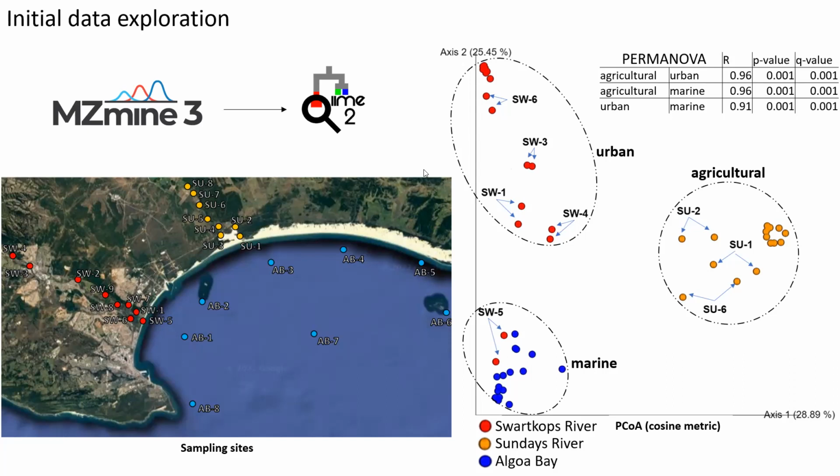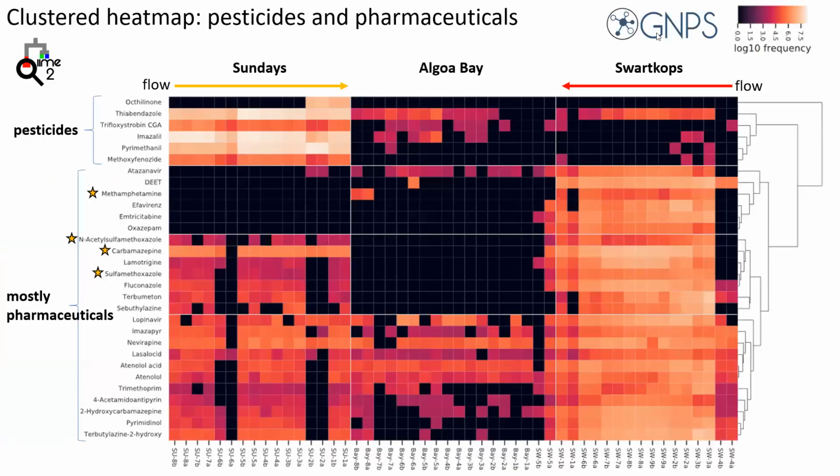What I did in the next step then, so upload the data to GNPS, and we have about 4,000 features altogether, and we got matches through GNPS for more than 200 of them. But now I had to manually curate them because sometimes you get matches that are basically false matches, so you can't trust it blindly. I manually curated the results, and I found about 60 features that were of high quality, when I look at the spectrum matches, of such quality that I'd be confident that I could convince peer reviewers for the study to be published that they're actually a decent match.